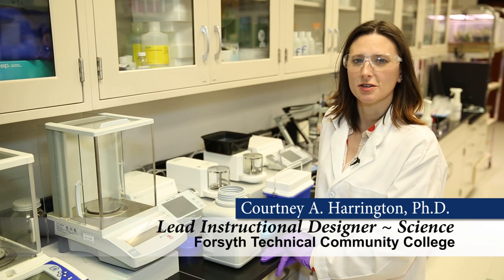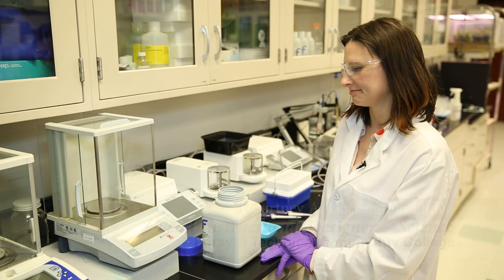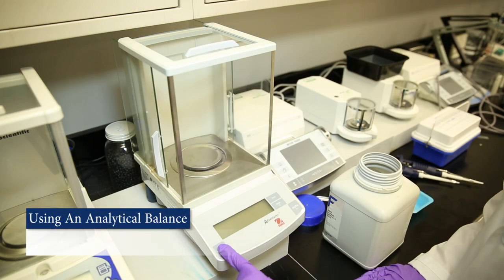Today we're going to go over the steps for using an analytical balance. The first step to using the balance is to turn it on.